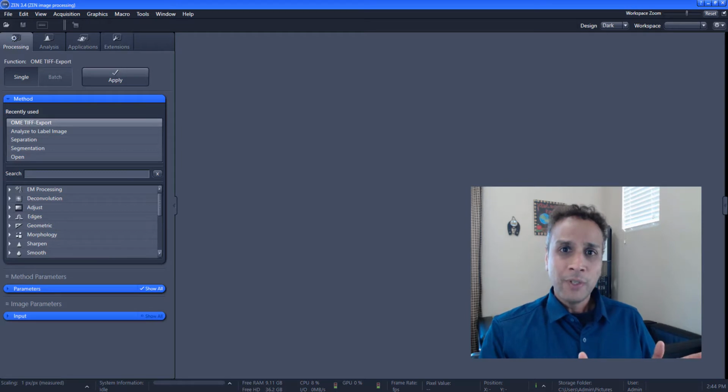But first, when it comes to object tracking, like I just mentioned, segmentation is step number one. And these objects can be organelles, cells, molecules, or non-biological examples. But the key here is to segment them into separate objects and provide that as an input to your tracking module. In many cases, for example in fluorescence microscopy, segmentation can be a bit easy because you already have fluorescence markers, and you probably just need an Otsu-based thresholding followed by watershed segmentation.